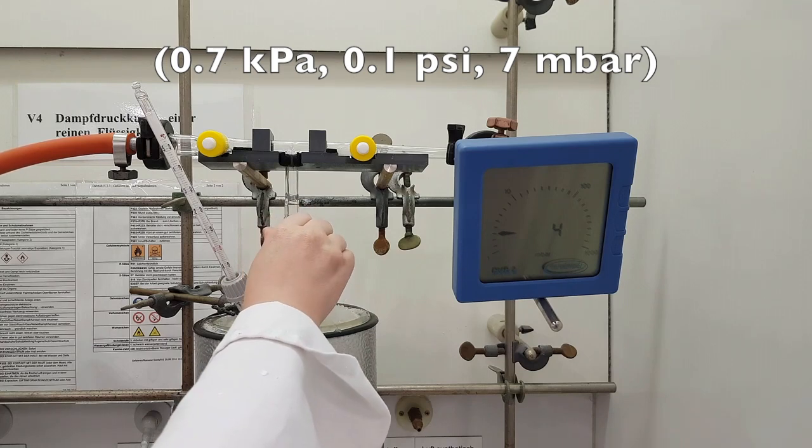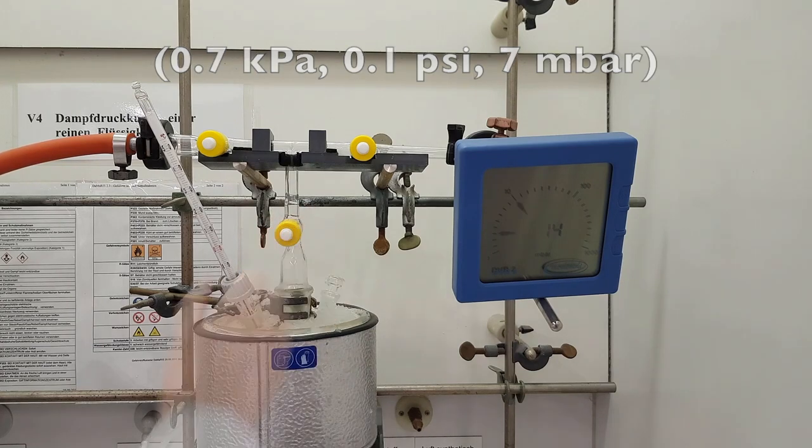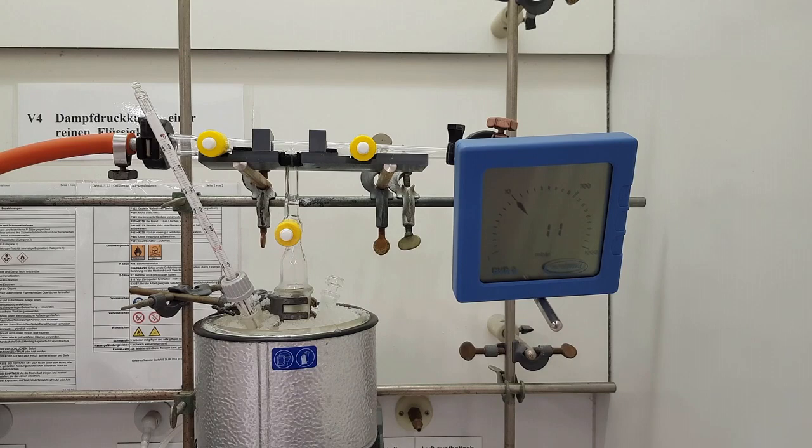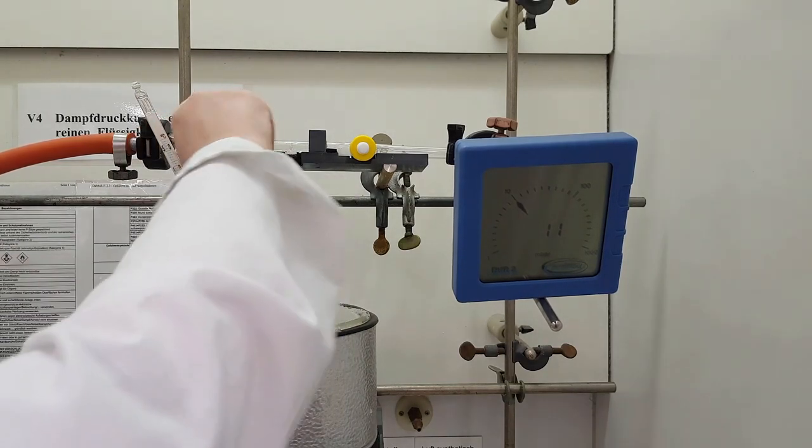The liquid starts to boil. The gaseous methanol replaces the air in the round bottom flask. Close stopcock 3 and switch off the vacuum pump.